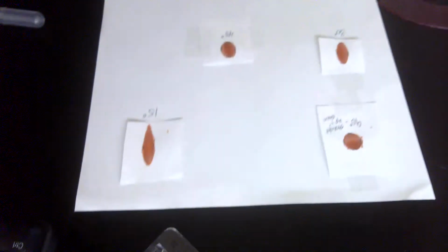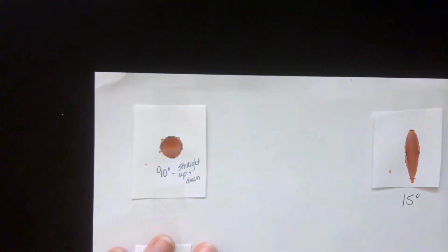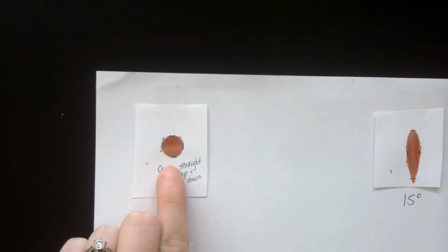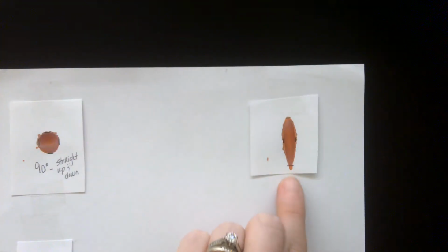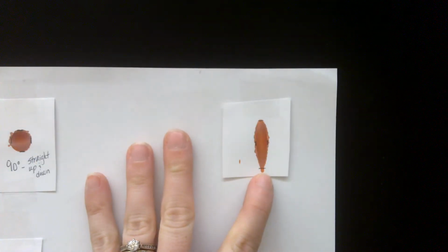All right, let me put this down. Flip it around. So I'm going to hold the ruler up to each blood drop, and you are going to read it, and you're going to get the length and the width of each blood drop. So what I did was I drew little markings from where you want to measure. So with the really elongated blood drops, I can get closer.